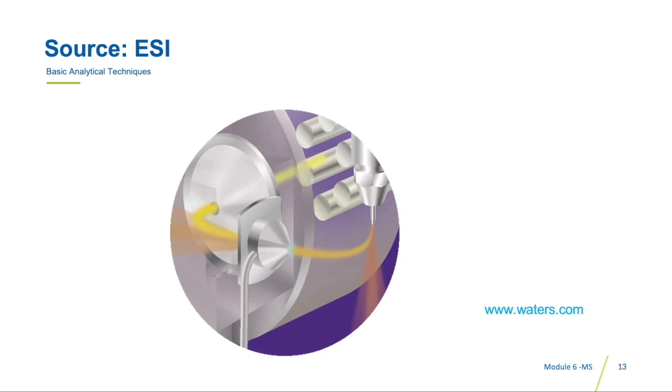The ESI source is used for pesticide residues, veterinary drug residues, mycotoxins, and many other food contaminants analyzed by LC-MS. As such, it is by far the most common source in the food safety laboratory.